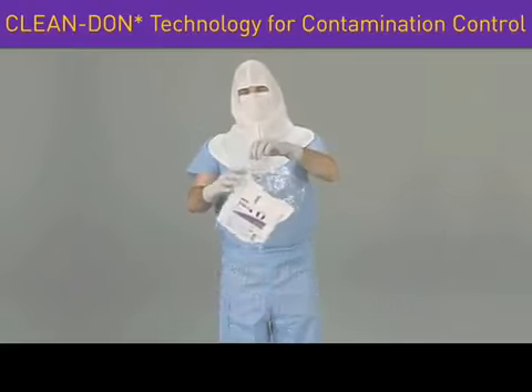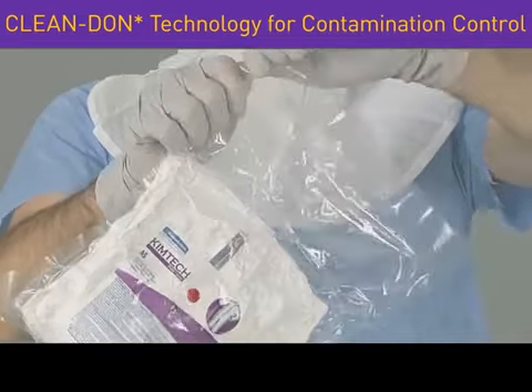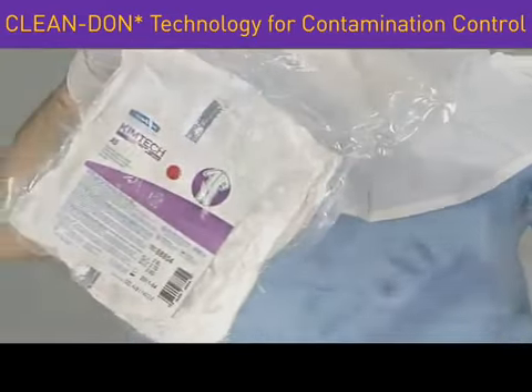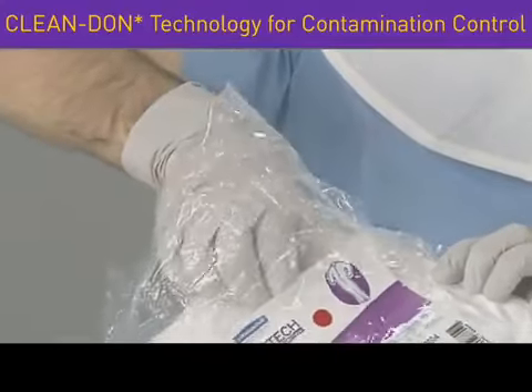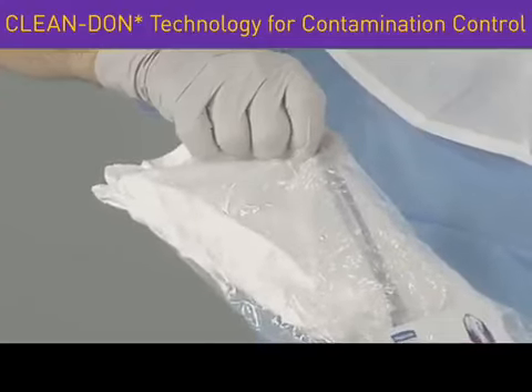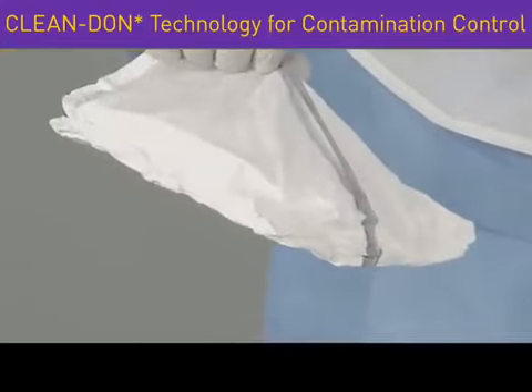First, we'll need to open the vacuum-packaged apparel by tearing at the notched edge. Now, grasp the blue line located on the inside middle back of the packaged apparel and pull out the garment, which is conveniently folded inside out and unzipped.